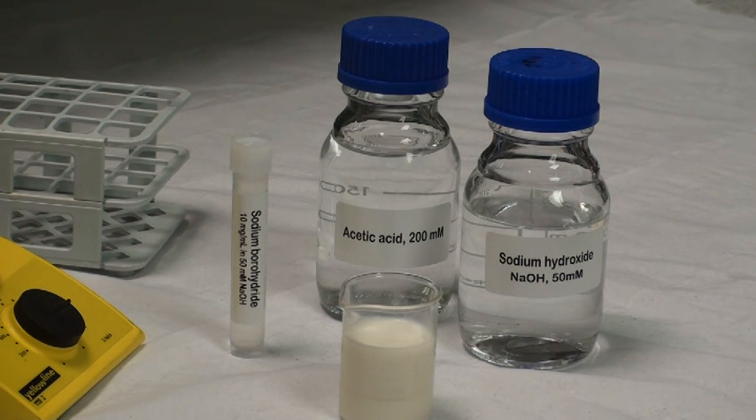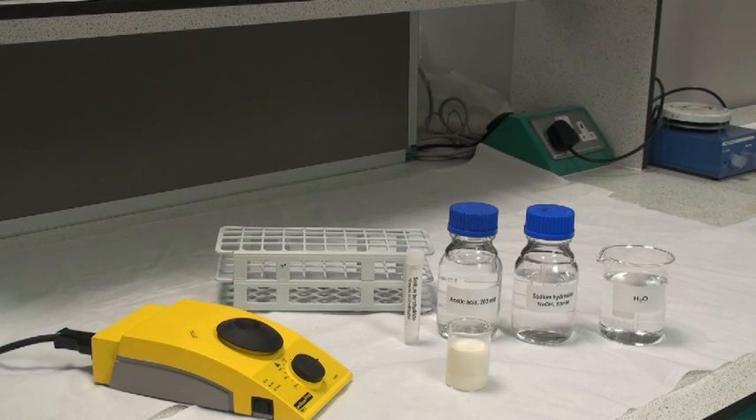The measurement of low levels of oligosaccharides in samples containing very high levels of monosaccharides can be very difficult — for example, measurement of lactose in beta-galactosidase treated milk samples, or measurement of sucrose in samples containing high levels of fructose and glucose. This can be achieved by first treating the sample with sodium borohydride to convert the sugars to sugar alcohols. Sucrose will not be modified, while lactose will be converted to lactitol, which is still hydrolyzed by the beta-galactosidase used in the lactose kit. In this example, we'll be looking at measurement of residual lactose in beta-galactosidase treated milk samples.